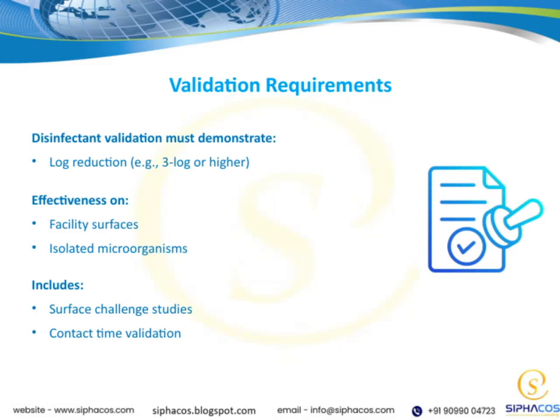Let's take a closer look at the validation requirements for disinfectants. First, it's essential that the validation demonstrates a significant reduction in microorganisms, typically a log reduction of 3 log or higher.